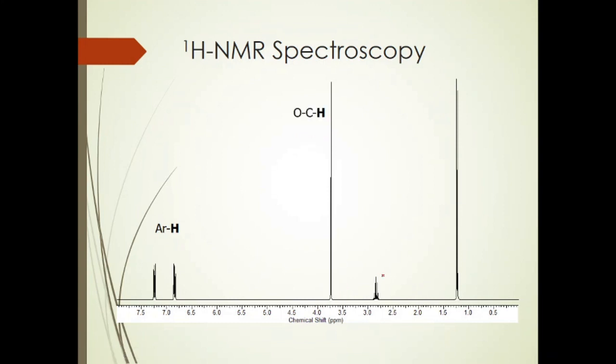Moving over to the next one, about 2.7 ppm, this is the region where we see allylic and benzylic hydrogens. So this would be a hydrogen that is next to a double bond of some sort. In this case, since we have an aromatic ring, these are likely benzylic, but this could be also next to a carbon-carbon double bond, carbon-oxygen double bond, something of that sort. And then next peak over, about 1.2, we're looking in the region where we see our typical saturated alkanes.